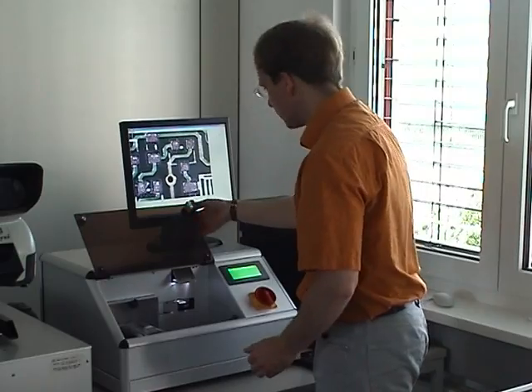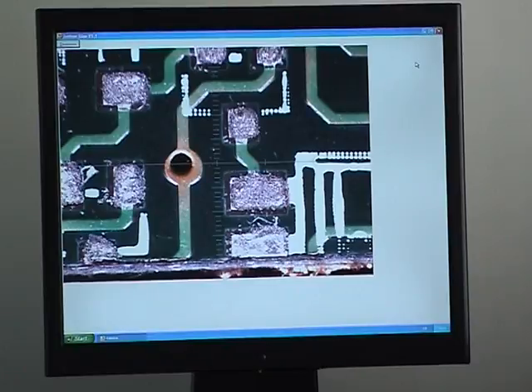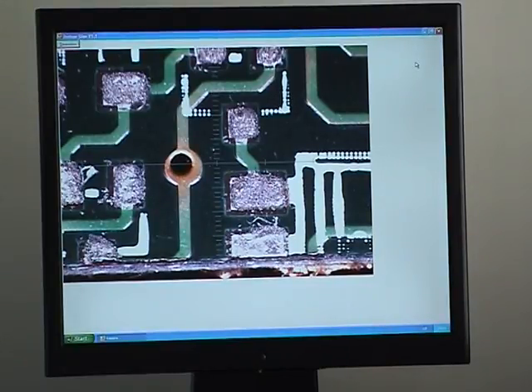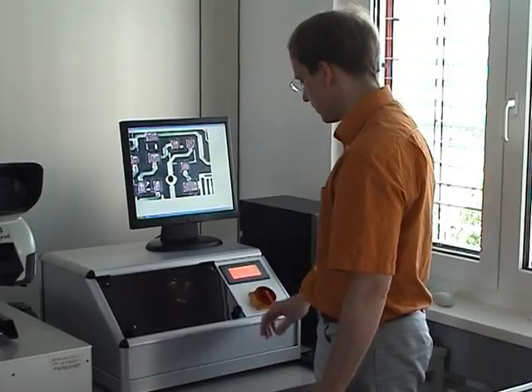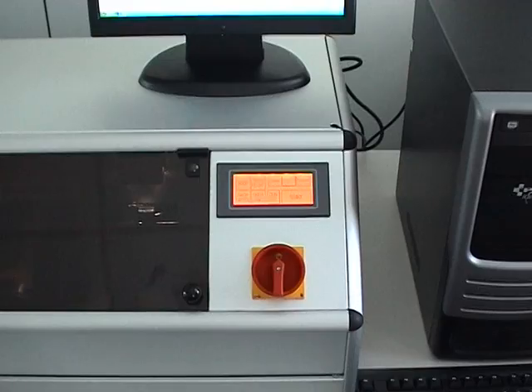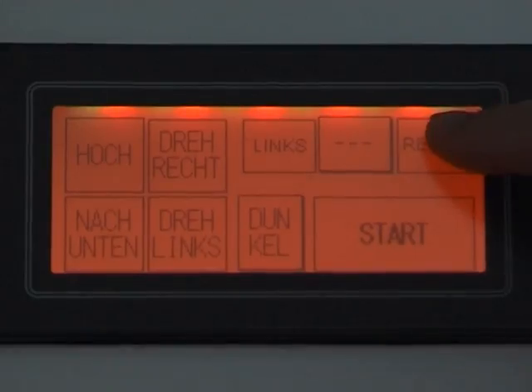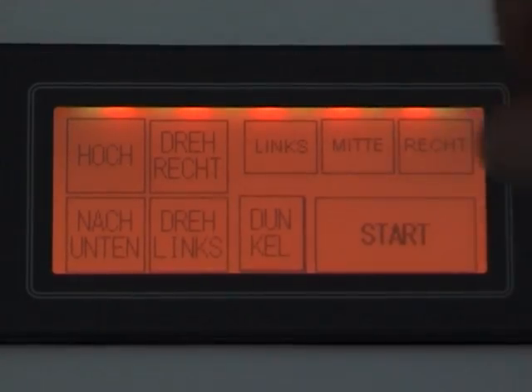A digital camera shows you the specimen on the screen with high magnification. Now the position of the specimen can be adjusted precisely by using the touch screen controls.